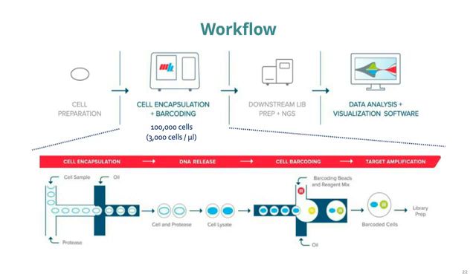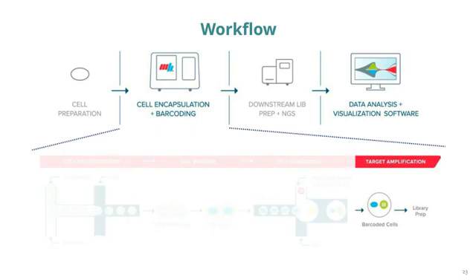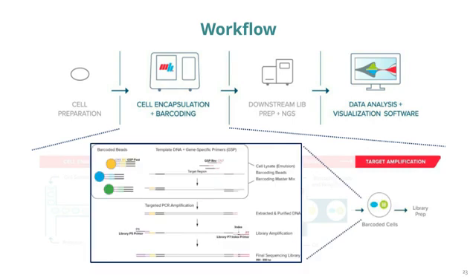And after that, the lysate has to pass again through the platform and is merged with droplets containing barcoding beads. And each of these beads is coupled to oligonucleotides that contain the handle for the library, the cellular index, and also the forward primer for the gene of interest, so that each of the cells will receive a combination of the about 300 primers to amplify the targeted regions.